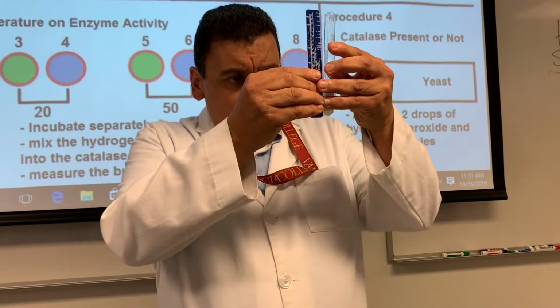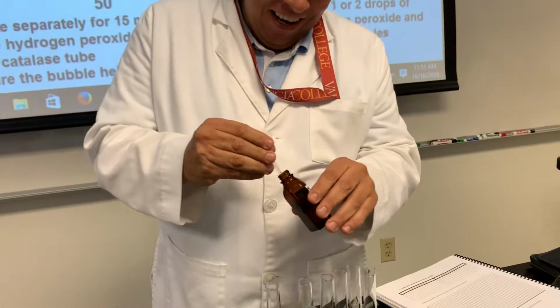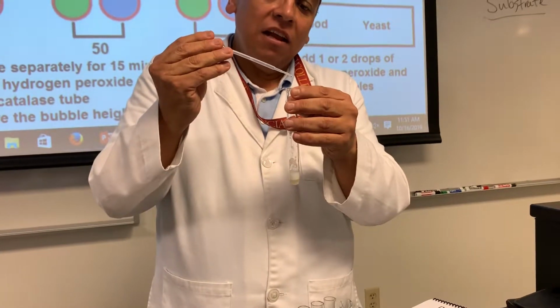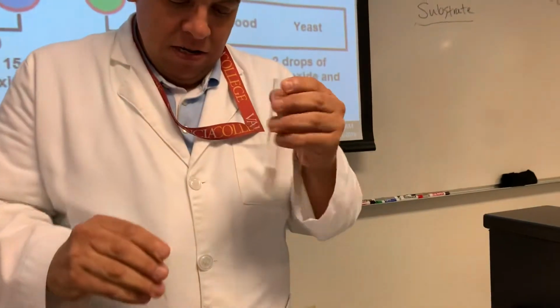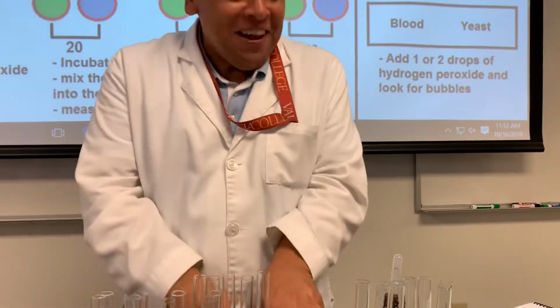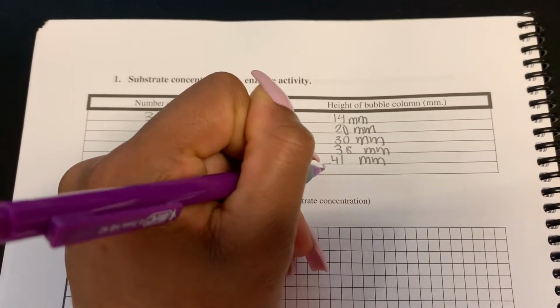We are now at 41. So Lordson is happy. We got the 40. Oh my, this is so exciting. All right, 18. 1, 2, 3, 4, 5, 6, 7, 8, 9, 10, 11, 12, 13, 14, 15, 16, 17, 18. Thank you for that. Wait, you didn't measure. I know, I will. Hang on. My God. It is going to be 50. Yeah, 50. Believe me.